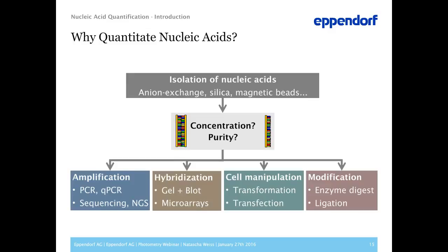Extra products may be generated during PCR analysis. Activity of enzymes can be reduced. Transfection shows low efficiency, or short reads during sequencing can occur. An easy method to perform quantification and quality control of DNA and RNA is represented by UV-Vis spectrophotometry.